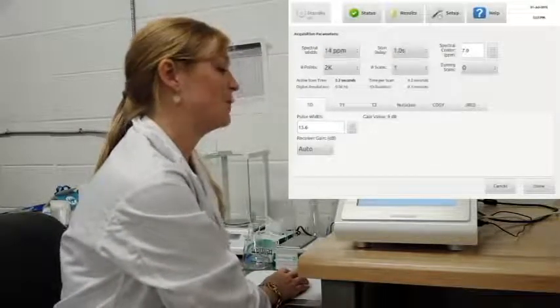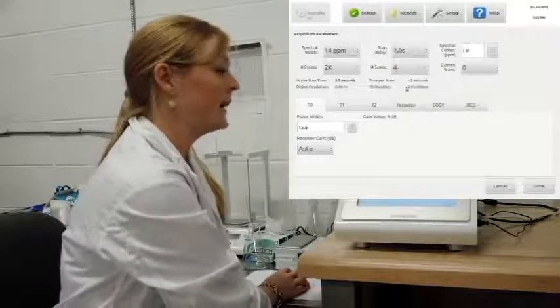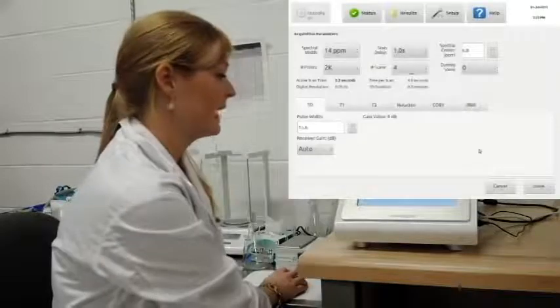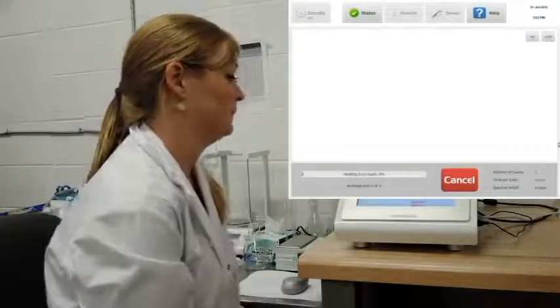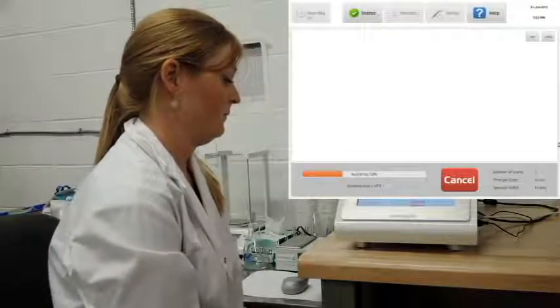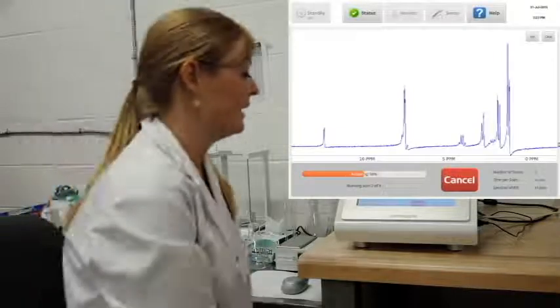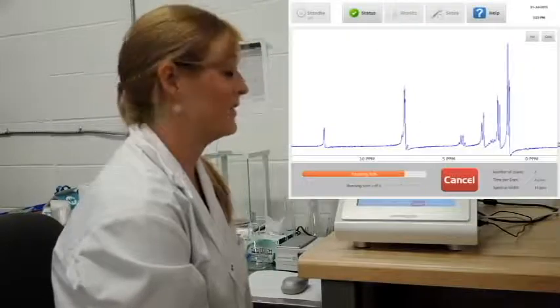I'm going to leave it at 2K points, 1 second scan delay, but I might go ahead and add 4 scans. And I'm going to change my spectral center, the transmit frequency, over, so I've got a little bit more baseline on each side of my spectrum, and then I'm going to hit go. So it's showing me my first scan. It'll run the additional 3, and we'll show those as well, so you can see the effect of signal averaging.